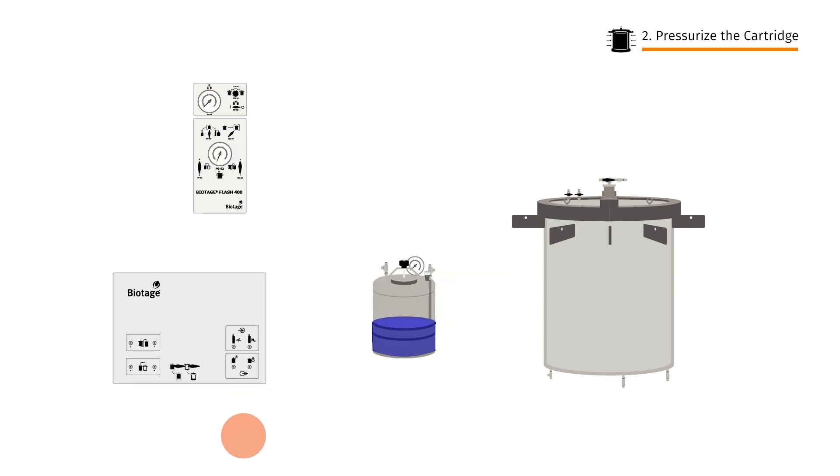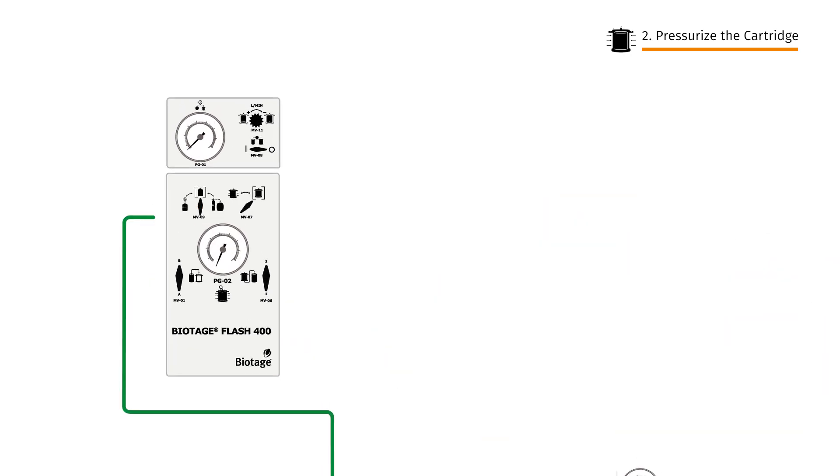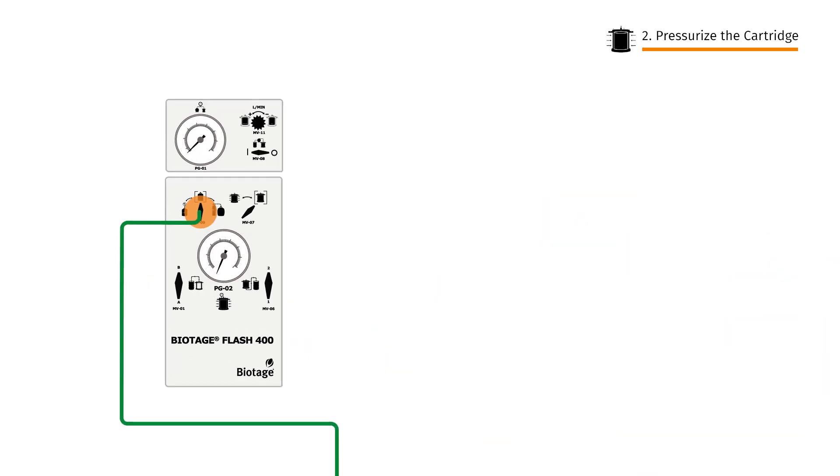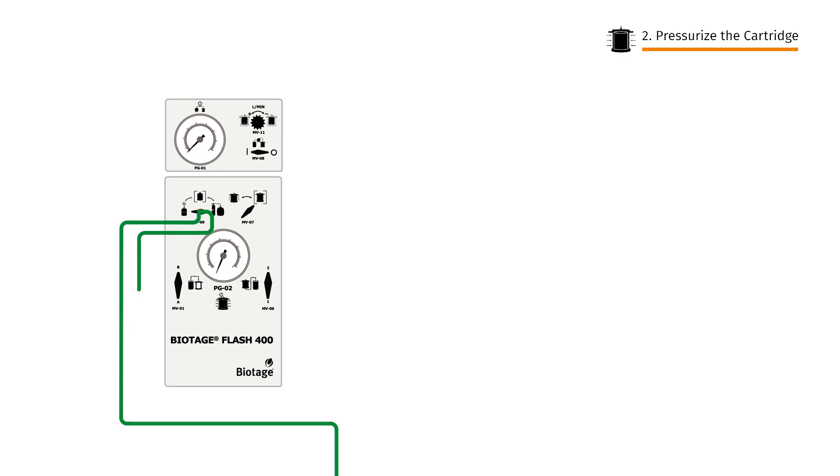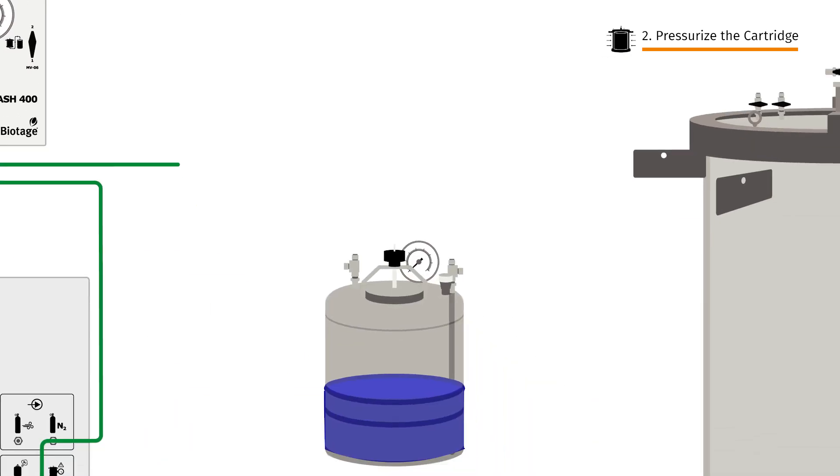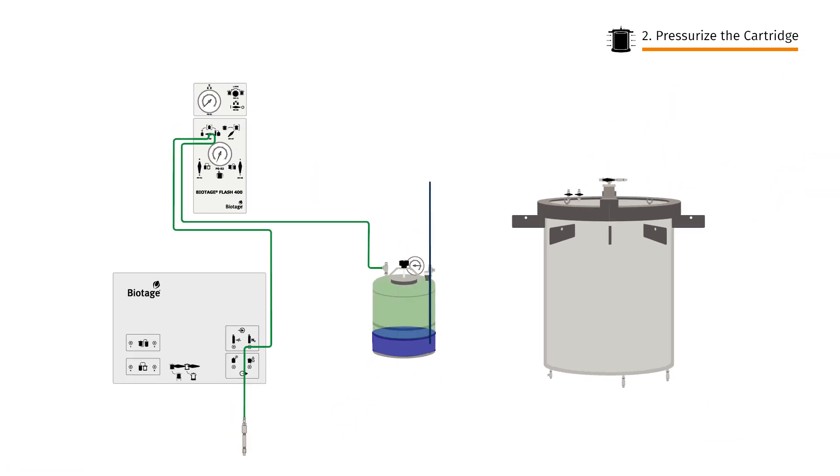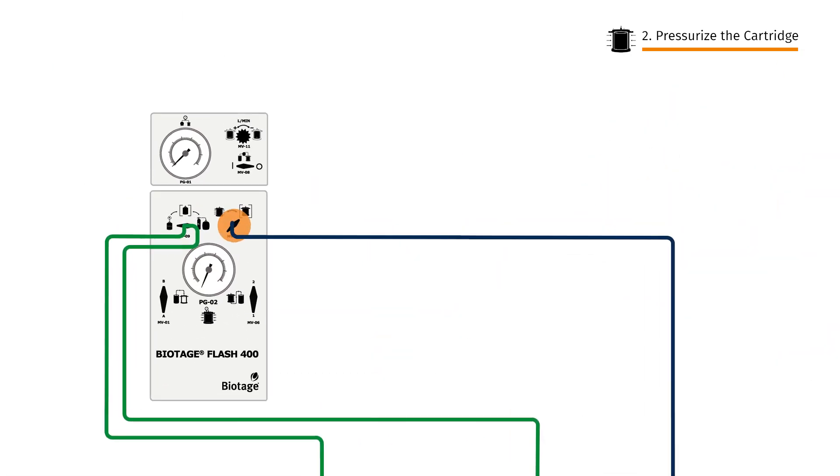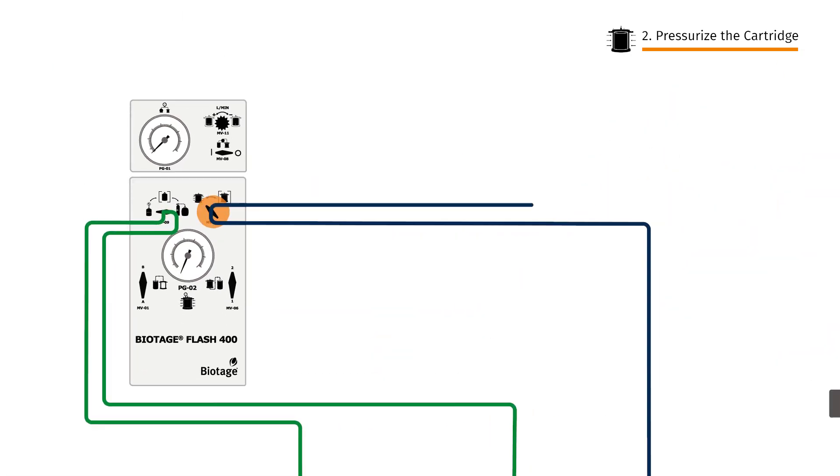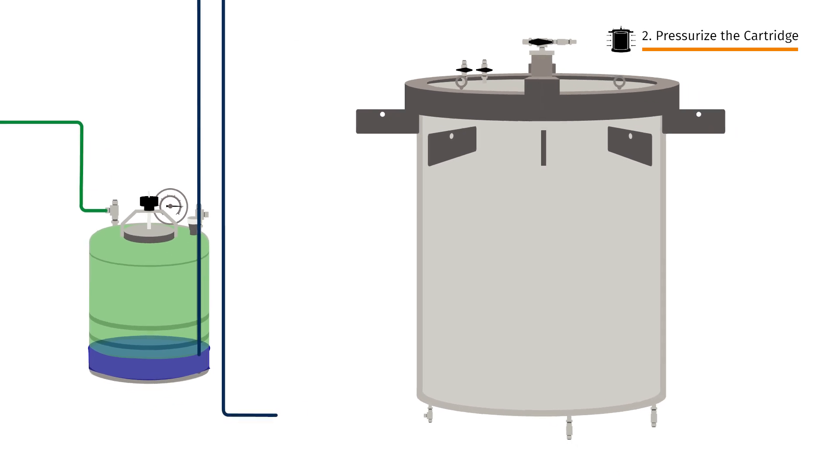We now connect external house nitrogen to the side panel gas inlet port. Open the nitrogen line on the control panel to pressurise and prime the compression fluid reservoir. Then open the valve to let the fluid into the compression module.